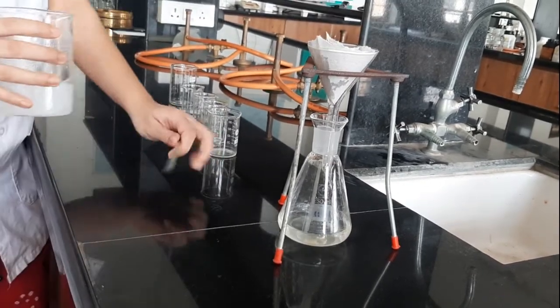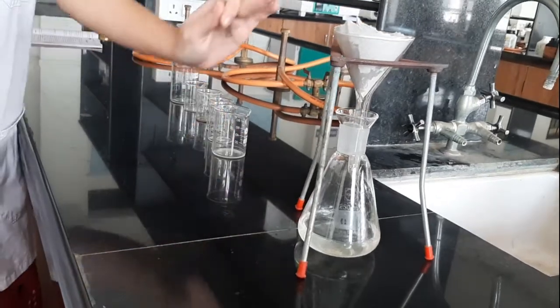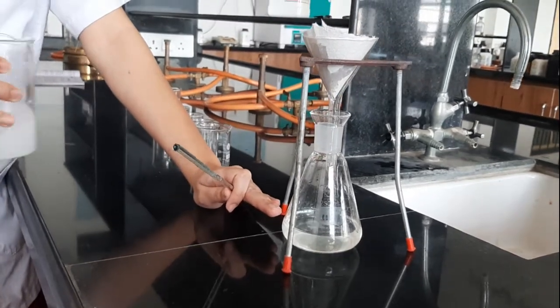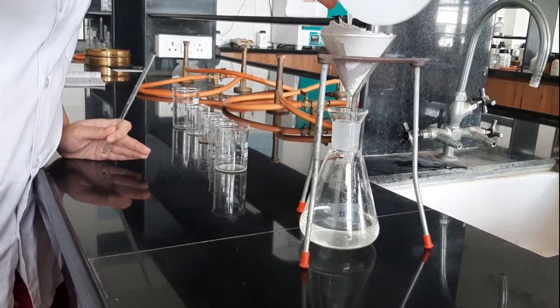Now you can see we have received here a clear filtrate. Now why is it clear? Because the undissolved boric acid has filtered out. But this solution is a highly saturated solution of boric acid.